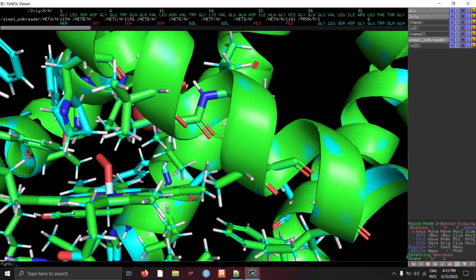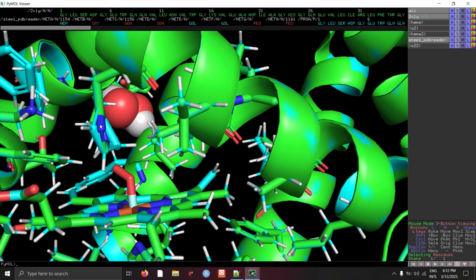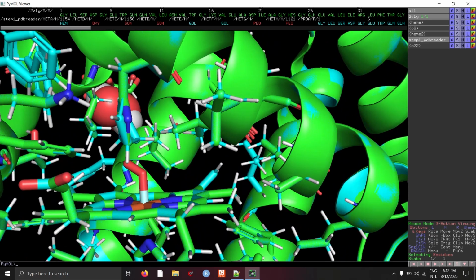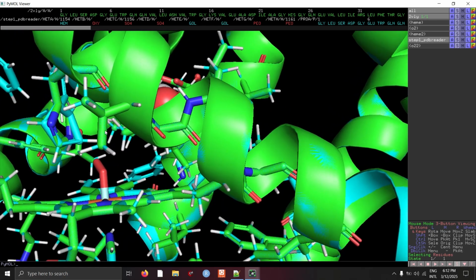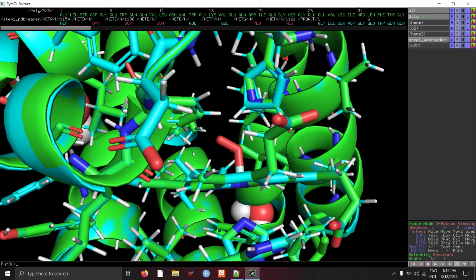We can see that one now has something weird on position 64, and then we have all these white spikes, which are actually hydrogen atoms. So the process that we did on CHARMM-GUI added the hydrogen atoms to the structure, to the whole protein. And here we have something a bit weird, but it's just amino acid number 64 in the mutated form, right? We have the phenylalanine right on top of the representation of the histidine. So we have to play around a little bit with that.